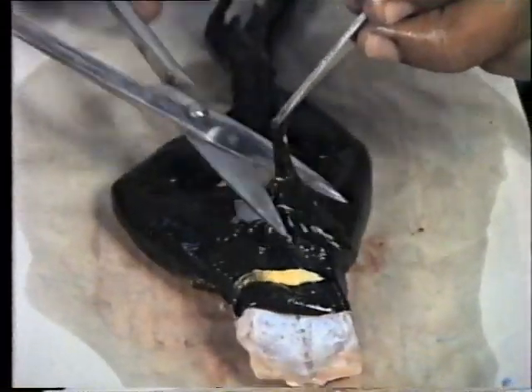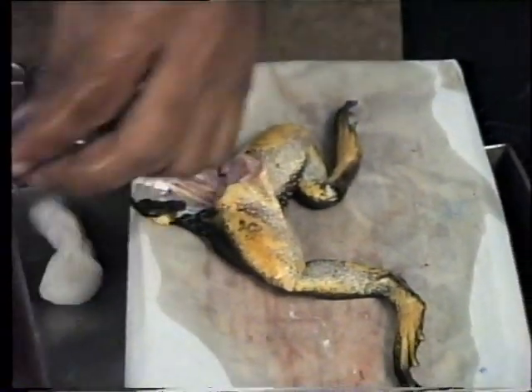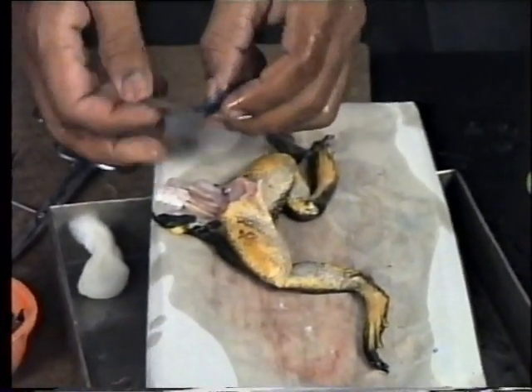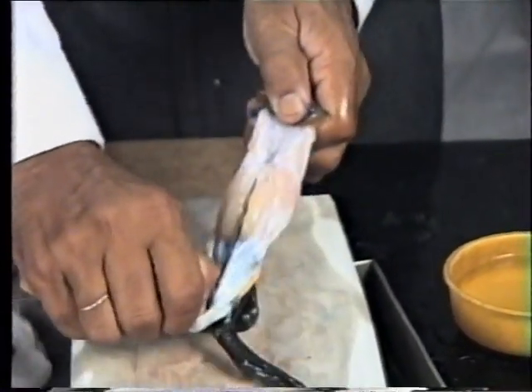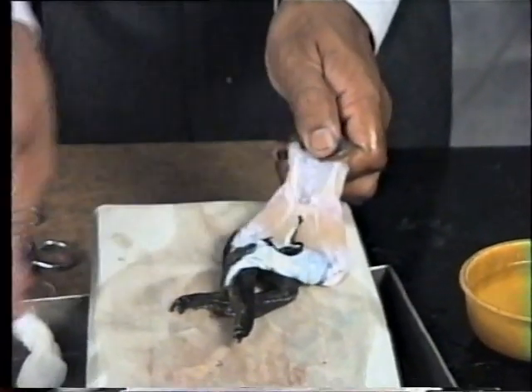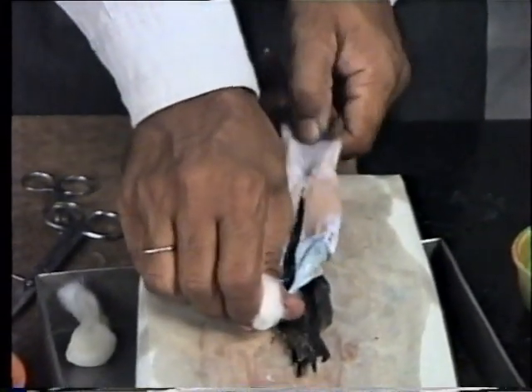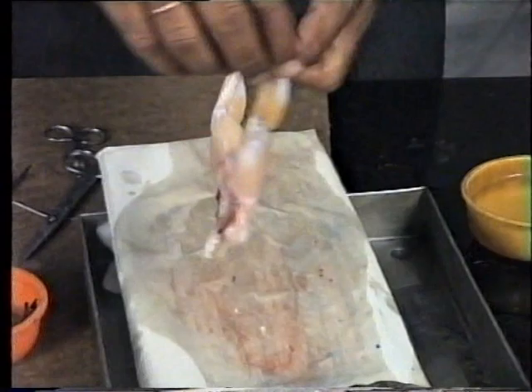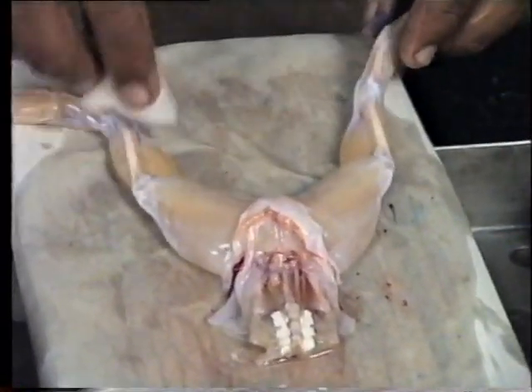Cut the skin on the back. Using the left hand, hold the skin with a cloth; with the right hand, strip off the skin. A little force is applied to remove the skin. Place the portion on the dissection board and apply some saline solution to avoid drying. Cut the unwanted muscles and the fascia.